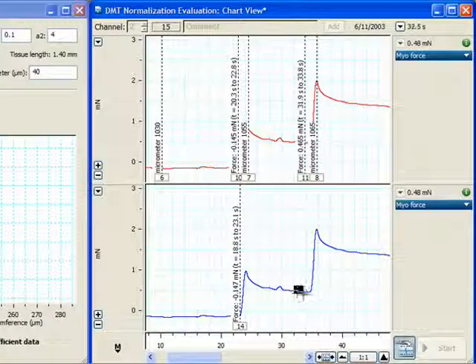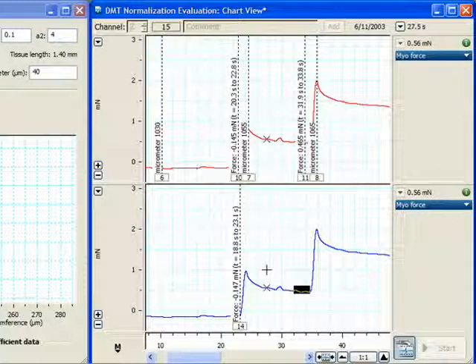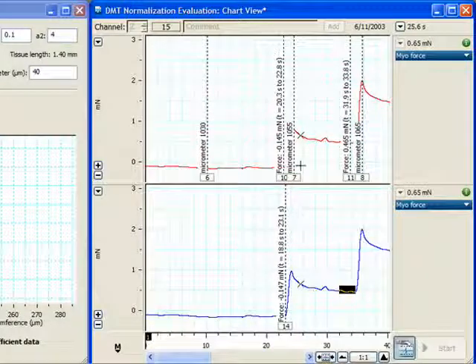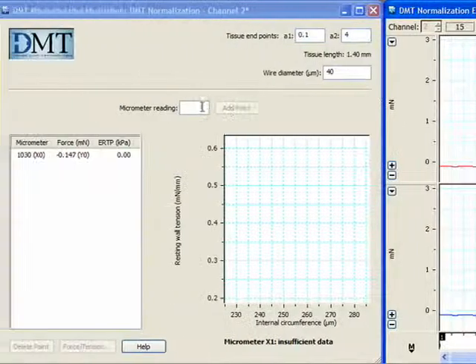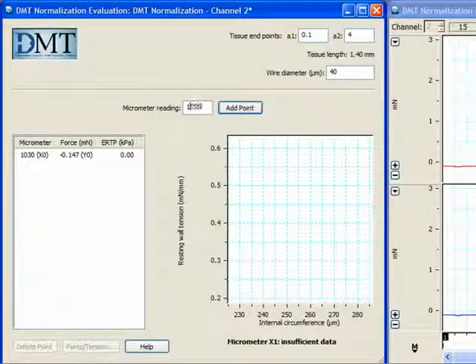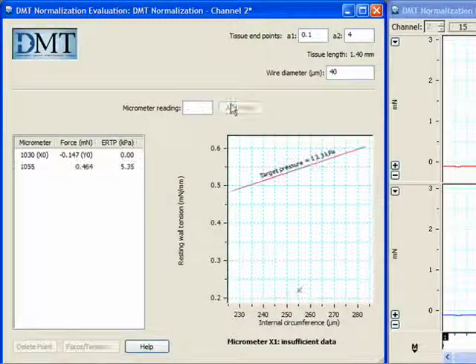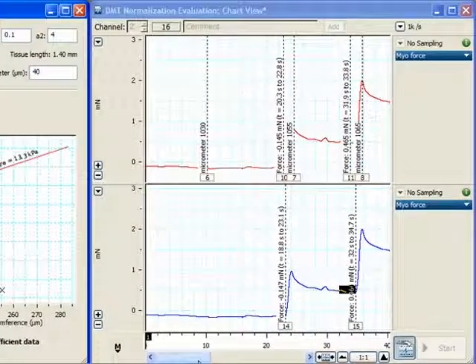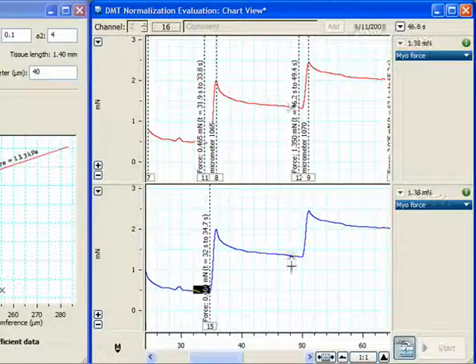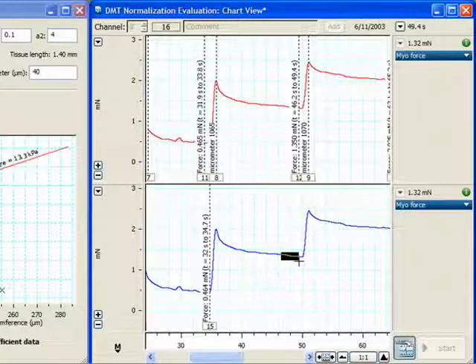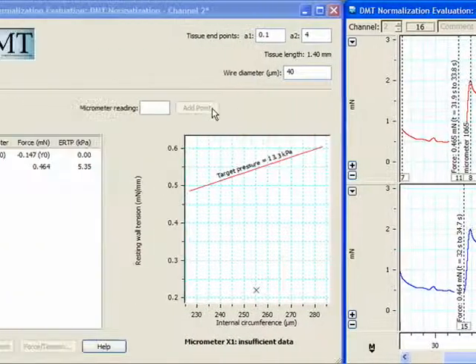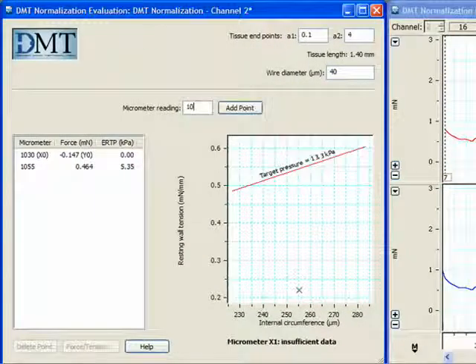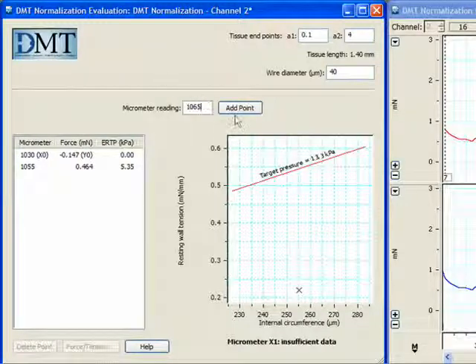Proceeding to step 2, I'm going to highlight the region of data where the force is stabilized, and enter the micrometer reading of 1055. Now we'll proceed to the third point. Highlight the stabilized region, enter the micrometer reading of 1065, and click Add Point.